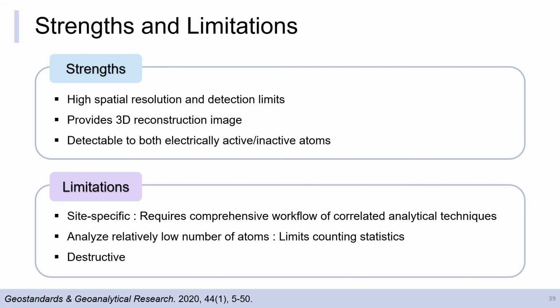Now, you know that APT is a powerful analytical tool, but there are a number of limitations as well. So, if you use APT, first you should find out whether APT is appropriate to analyze your sample.